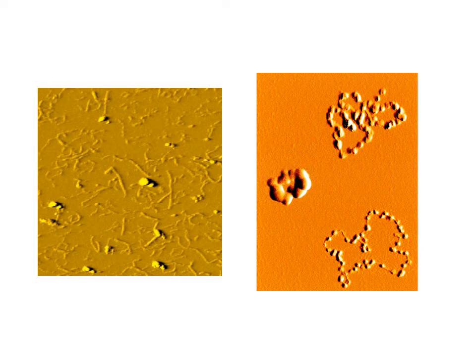This is another atomic microscopy image. This is apple pectin. Have you ever heard the phrase, an apple a day keeps the doctor away? Well, it could be true.